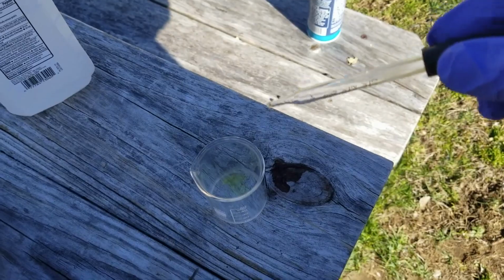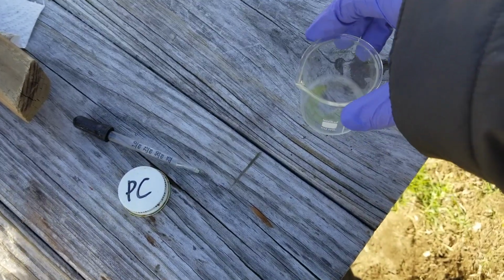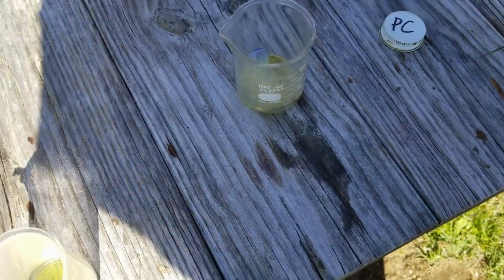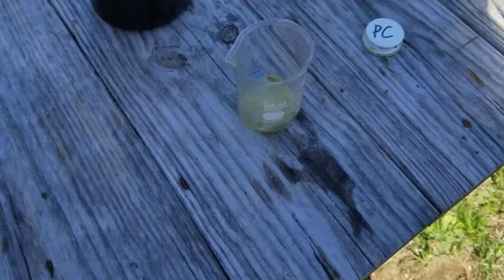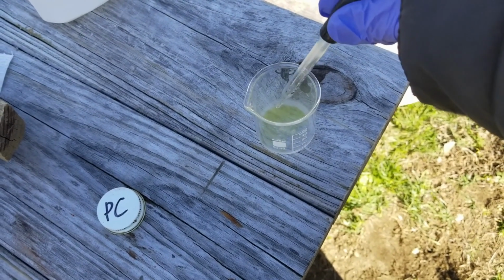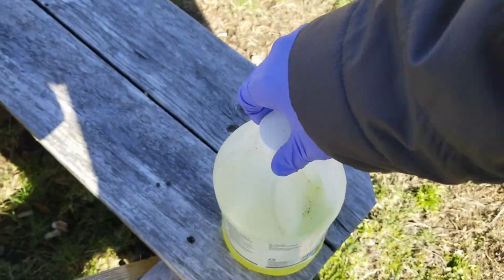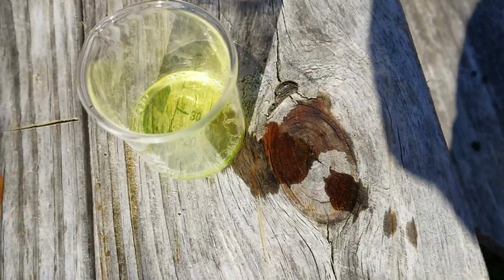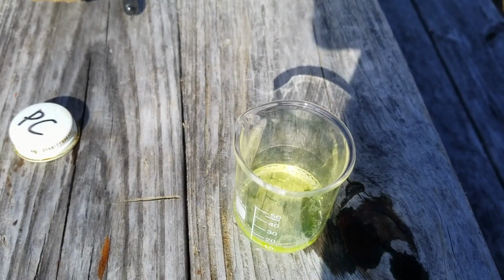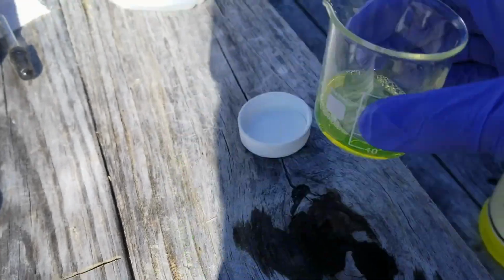Wow, nothing? But perhaps, this is my theory. I think the butane is simply too cold. Let's add a bit more. Yeah, I think it's just too cold and no reaction can really take place. So I think for the rest of it, I'm just gonna make ammonium nitrate. First of all, I can't pour it in. Spilling it on the picnic table. But second of all, this is way too much ammonia, so I'm gonna add some back in here.